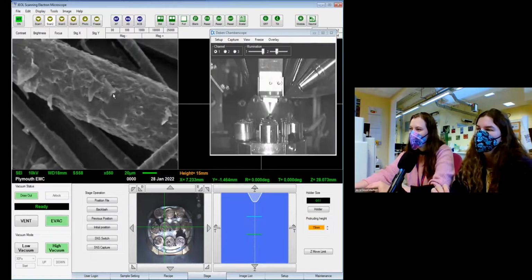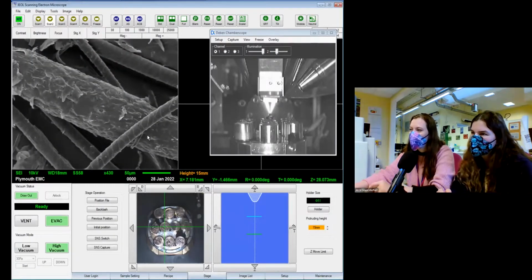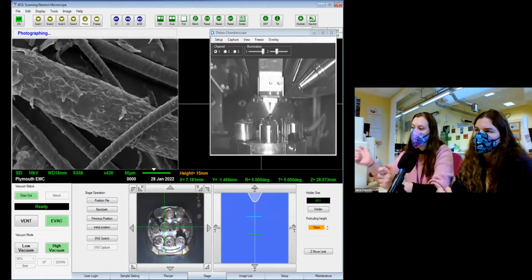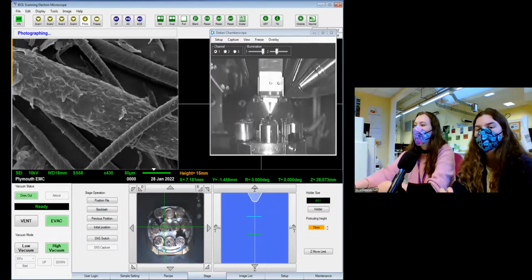So we've got a different type of hair there. That's so weird. And it's all very flaky here. I think this coarser bit is part of his neuter coat. When you get setters neutered, their coat can change, and you often get these blonder, almost frizzy bits that come through. Our previous dog Peggy had some yellow stripes on her legs. Laszlo's got two stripes down his back, and it feels very different. It feels very dry. So I wonder if that's what this big chunk in the middle is, because it's very flaky and very different from the other.